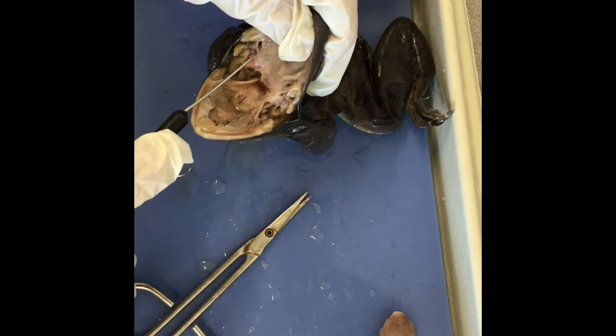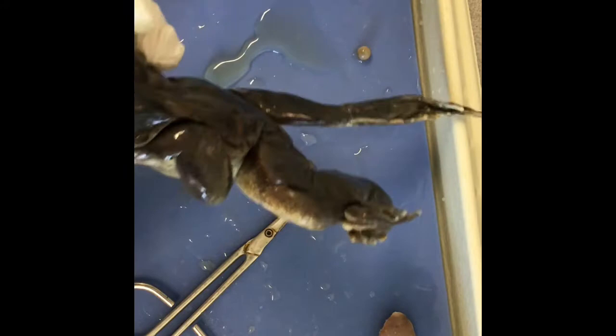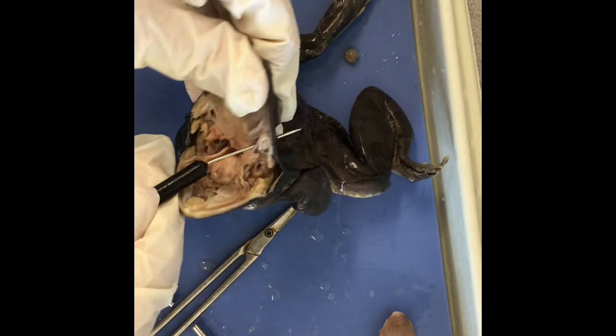On the side here, you can see these two holes. They are the eustachian tubes, used for equalizing pressure in the frog's ear, and they lead to the tympanic membrane. If you poke through that hole, it leads to the tympanic membrane, which is essentially the outer ear. So: eustachian tube — inner ear; tympanic membrane — outer ear.